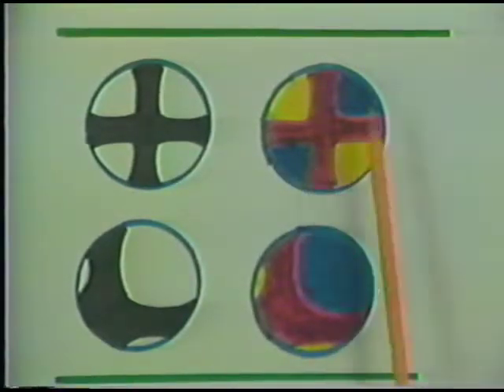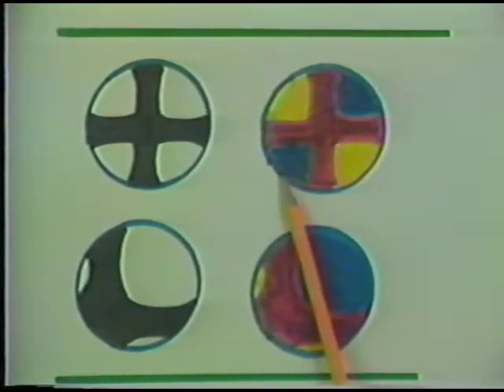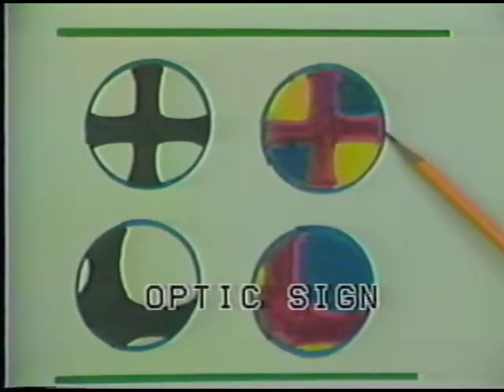And you can see that with the gypsum plate, you get addition of colors, and they change from white to blue in the northeast and southwest quadrants, and a change from white to yellow in the northwest and southeast quadrants. An indication then of positive optic sign. The minute you know that the sign is positive, then you know that epsilon is greater than omega, or that E is the slow ray.